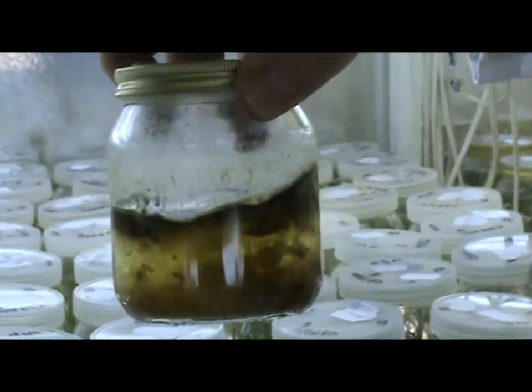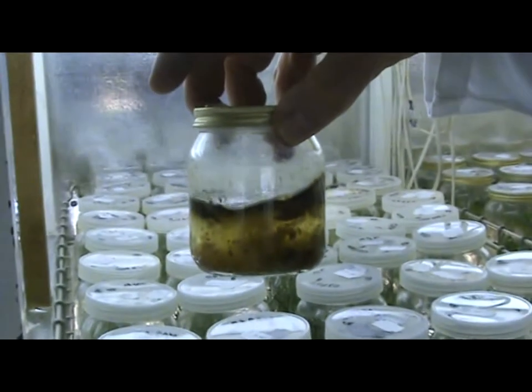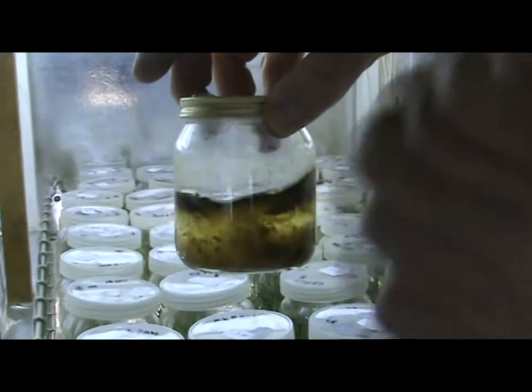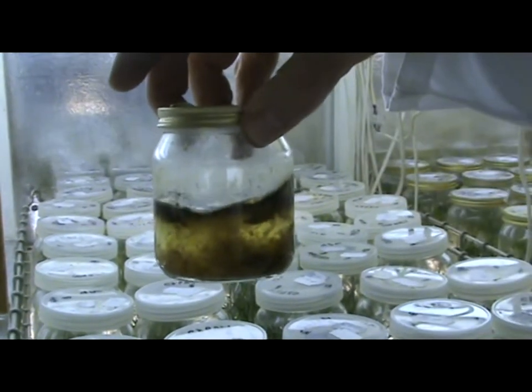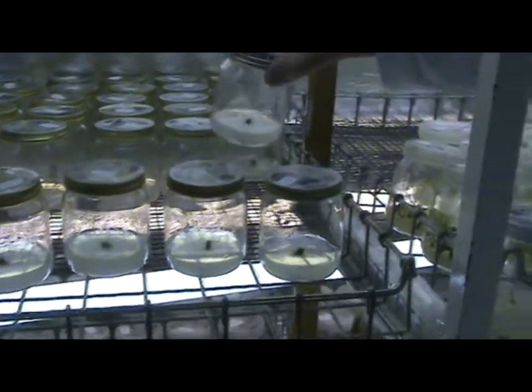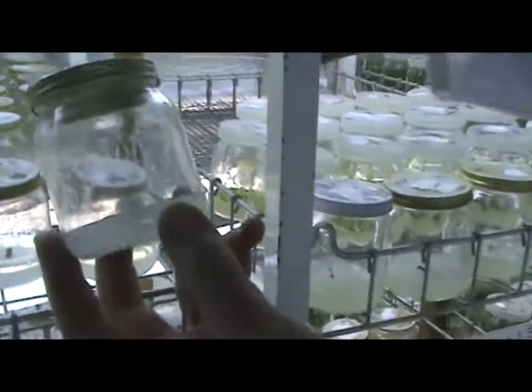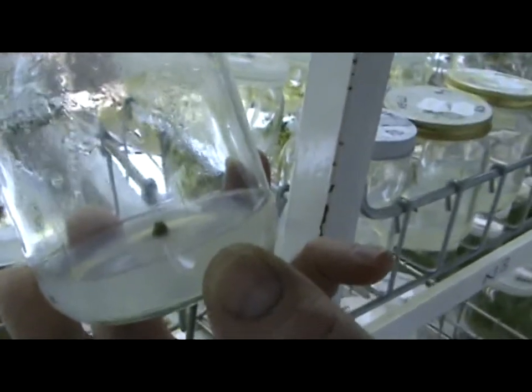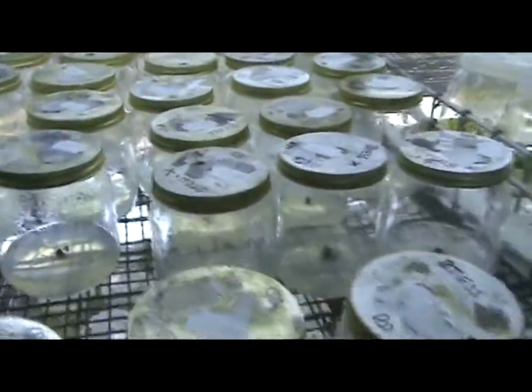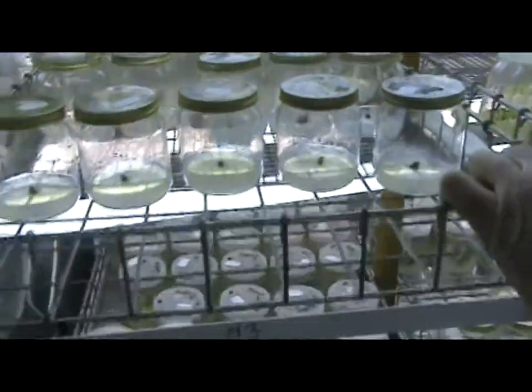I wonder if you could explain the life of how you grow a bilberry from scratch, if you like, to just before it gets sent out into the moors. Well, it's quite a long-term process, but initially we take a bud, a piece of stem from a bilberry plant. We sterilise that in Domestos, which kills all known germs, as everyone knows. It also kills the plant if you leave it in too long, so we have to leave it in for a short period to sterilise it.